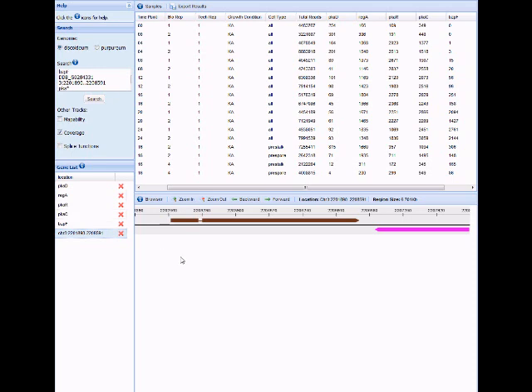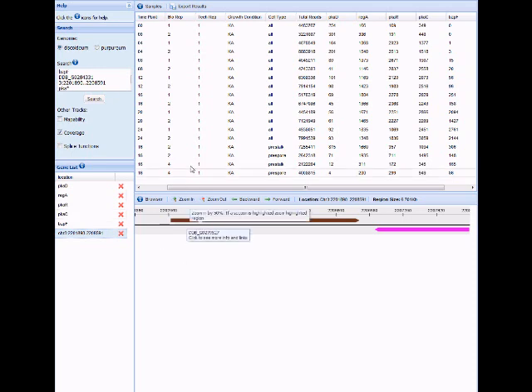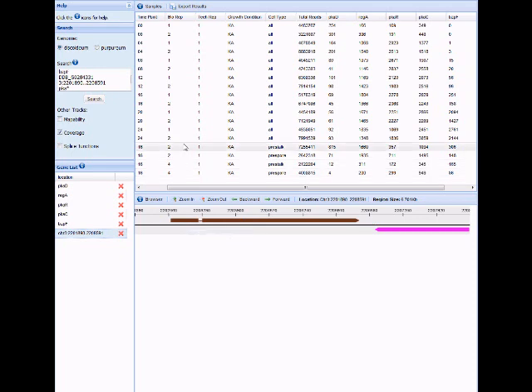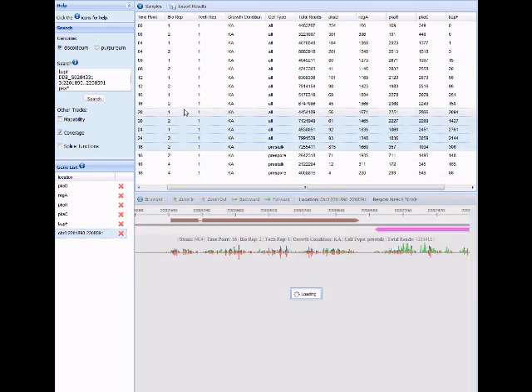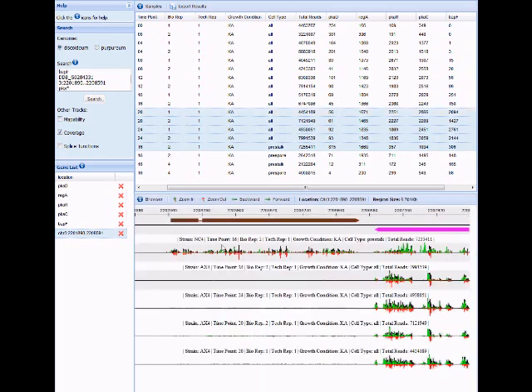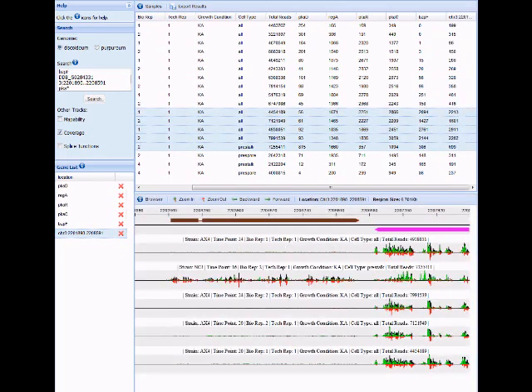From the sample panel, you can select a list of experiments for which you want to see the coverage. You can use shift and click or control and click to select multiple samples. The coverage for each sample appears as a track in the browser.